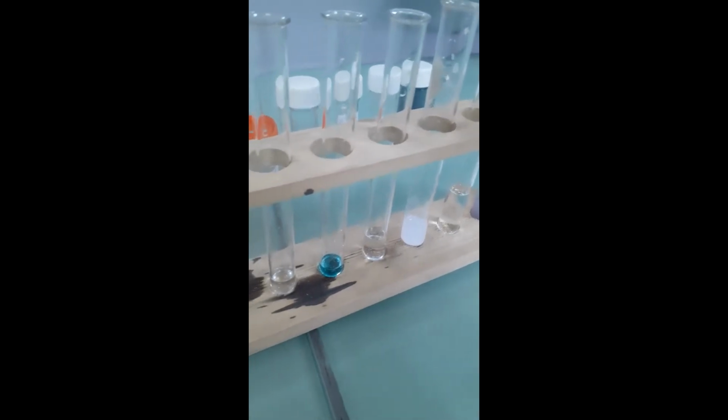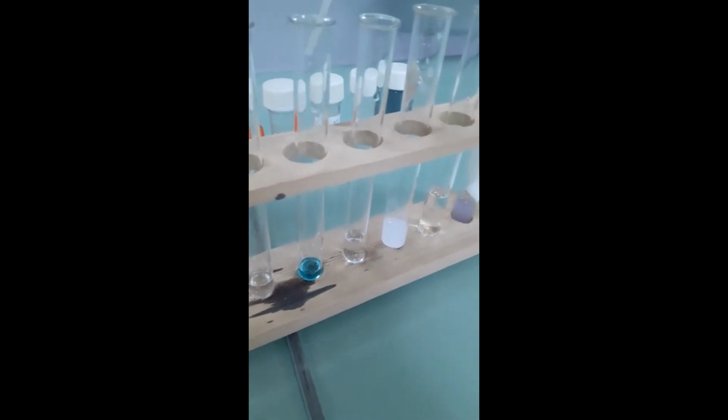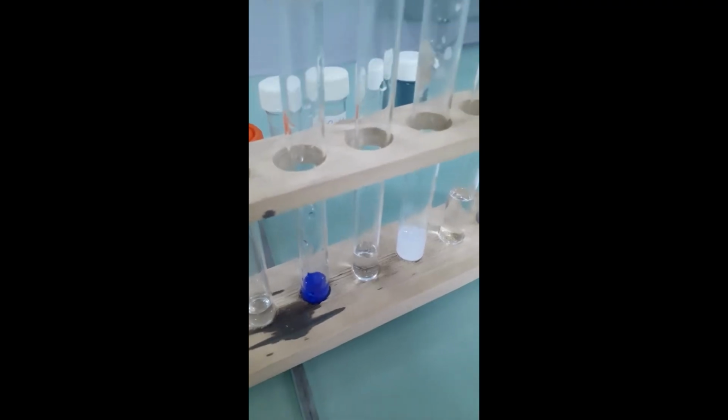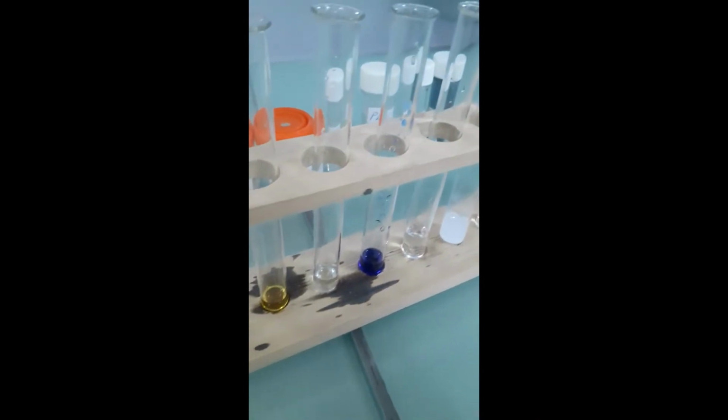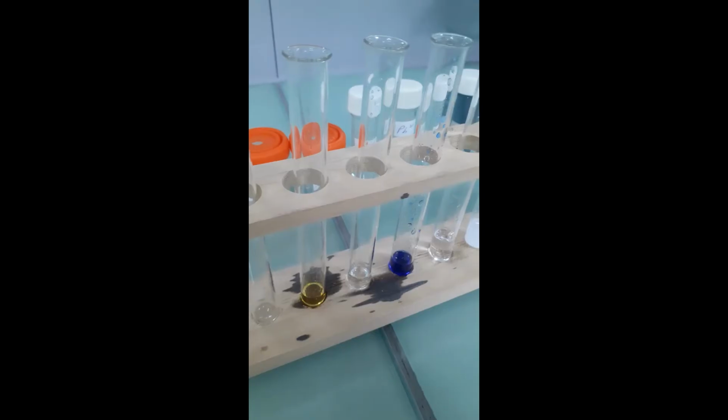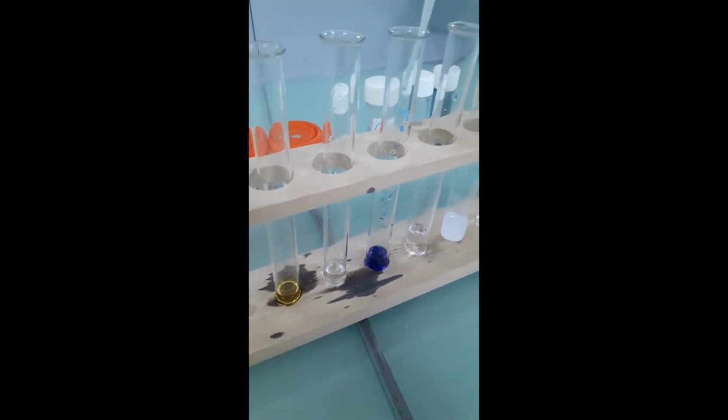Next test tube, there is Cu2+. Again, I'll be adding a few drops of dilute ammonia. Some more dilute ammonia will be added.